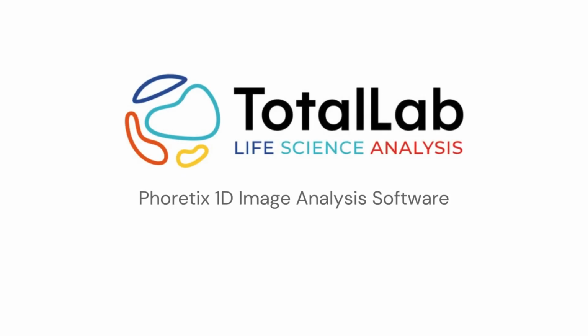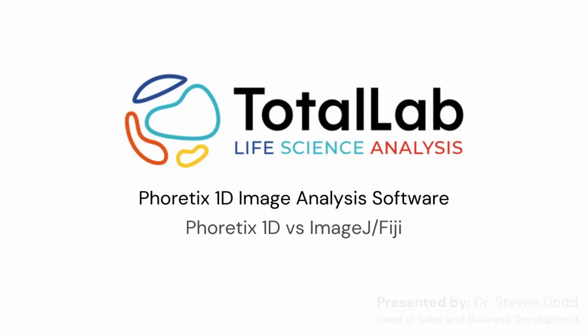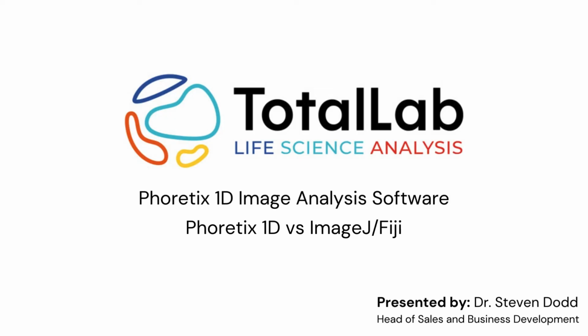Hello everyone. So today I'm going to be performing the same analysis in both Phoretix 1D and ImageJ to show you the differences between the programs and the benefits that Phoretix 1D can bring to your analysis.